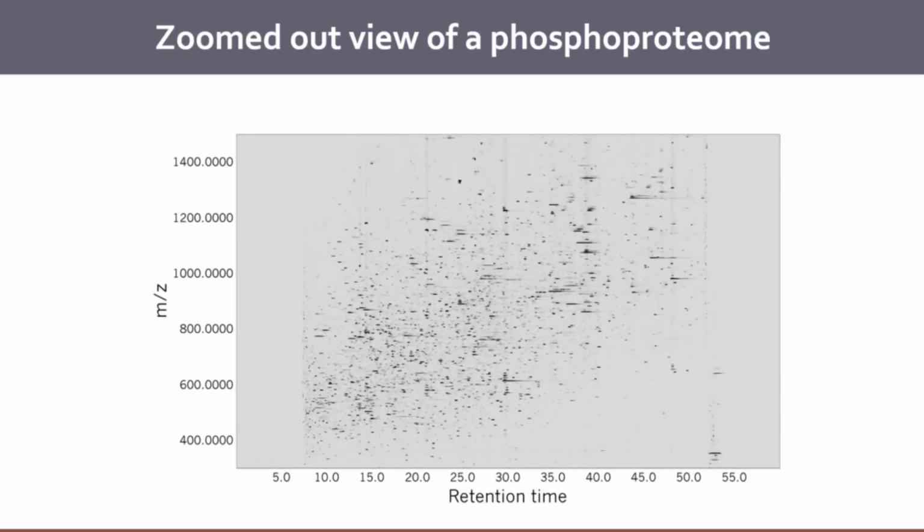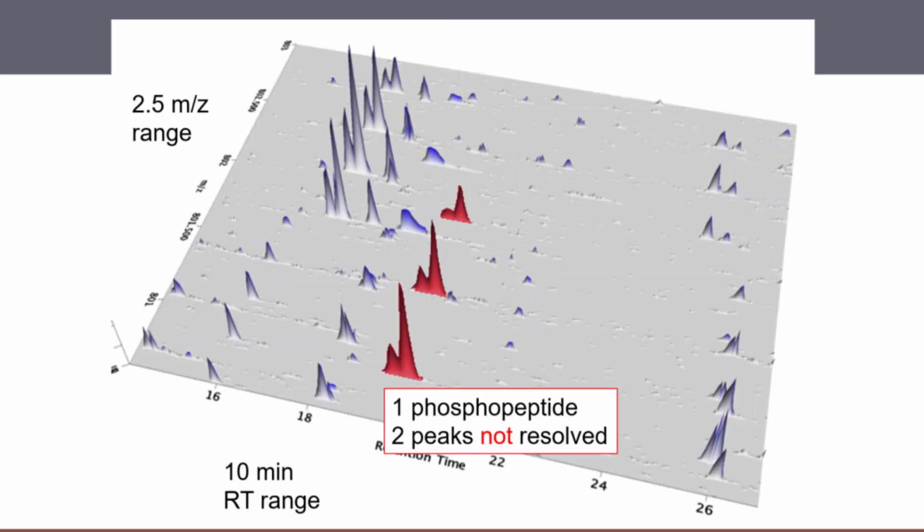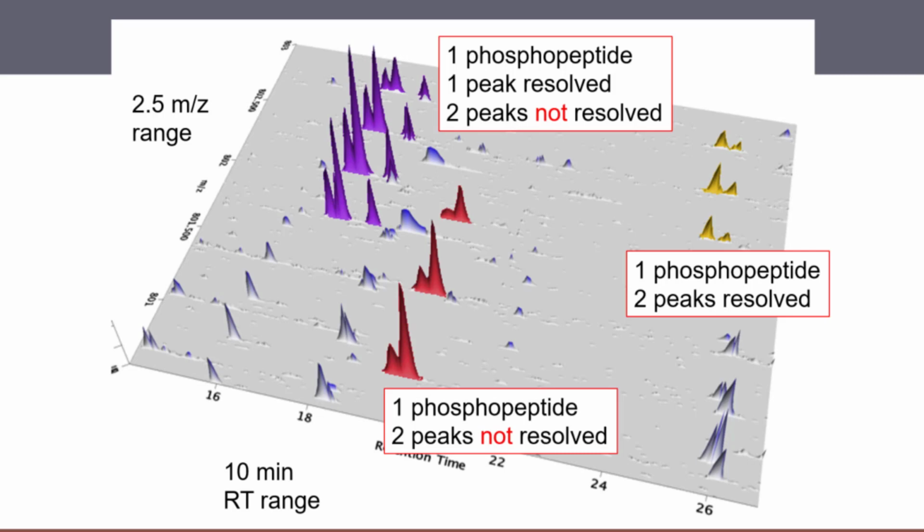So this is a figure I kind of like as well. If you take data, plot it in these two dimensions, and blow up this region where it looks like there's not much data, there's actually a lot of data there still. We have this incredible dynamic range, but almost all of these peaks have multiple chromatographic peaks. So this one has basically three peaks at the exact same mass.